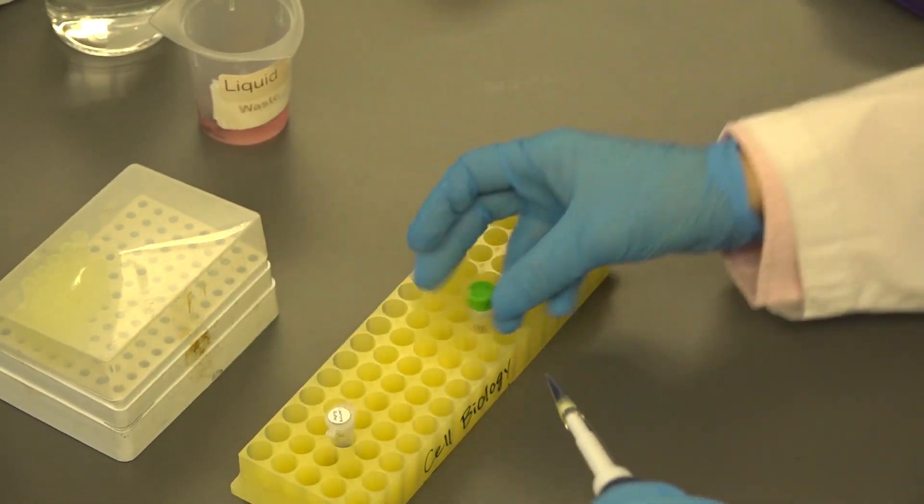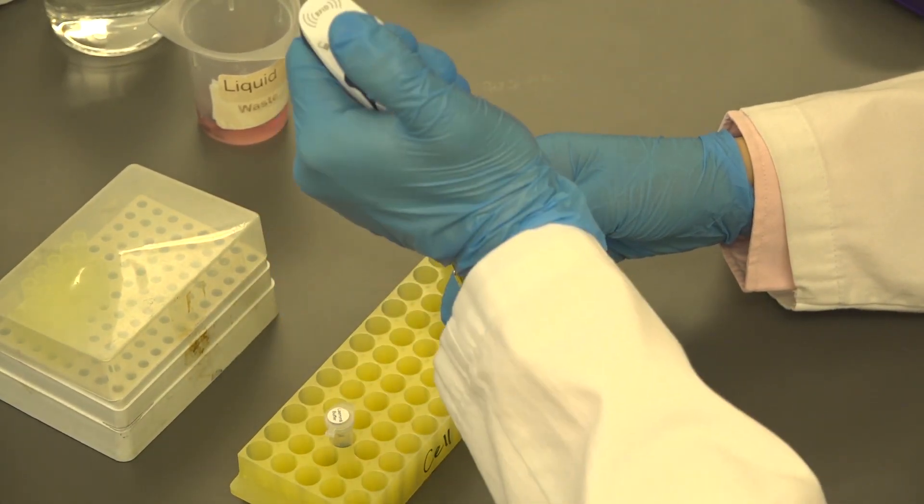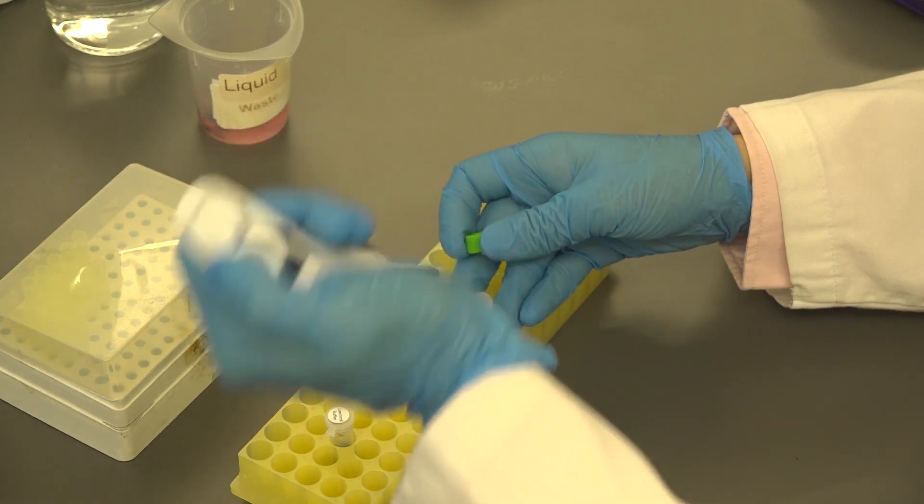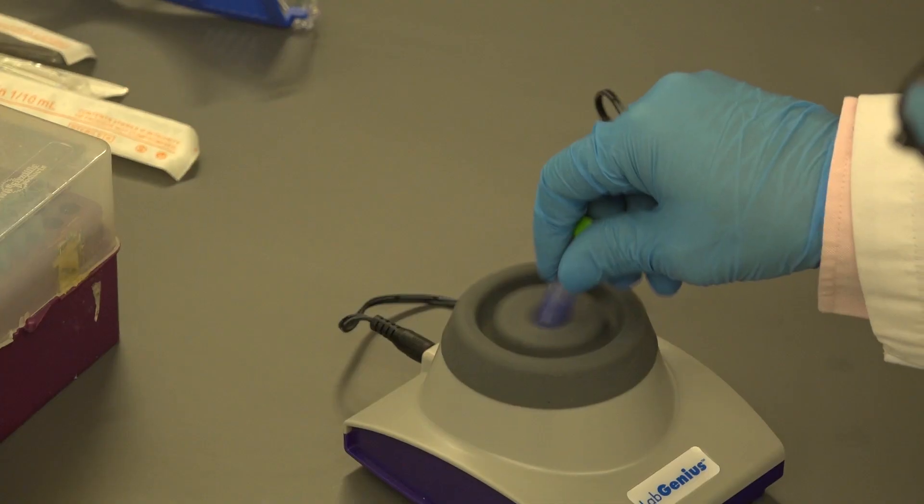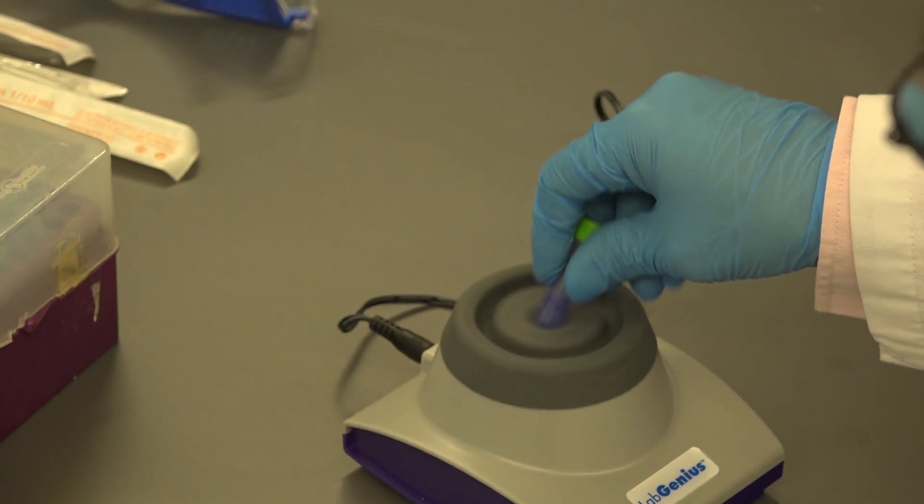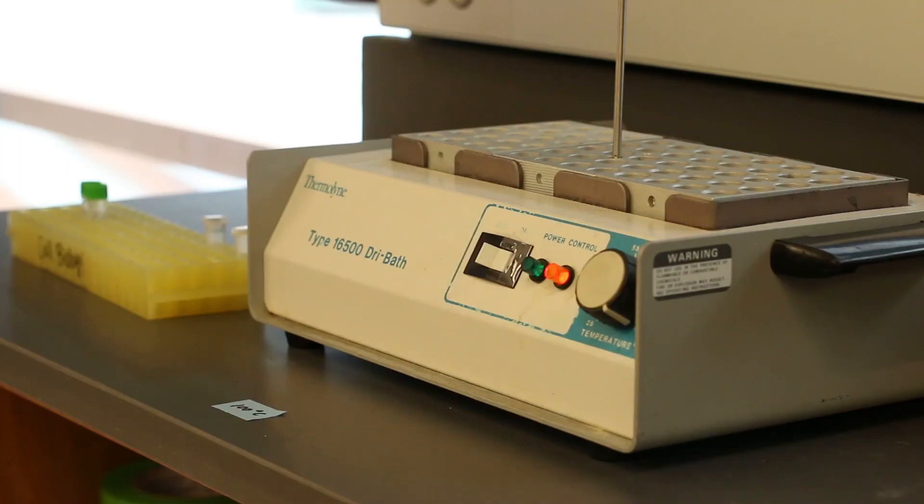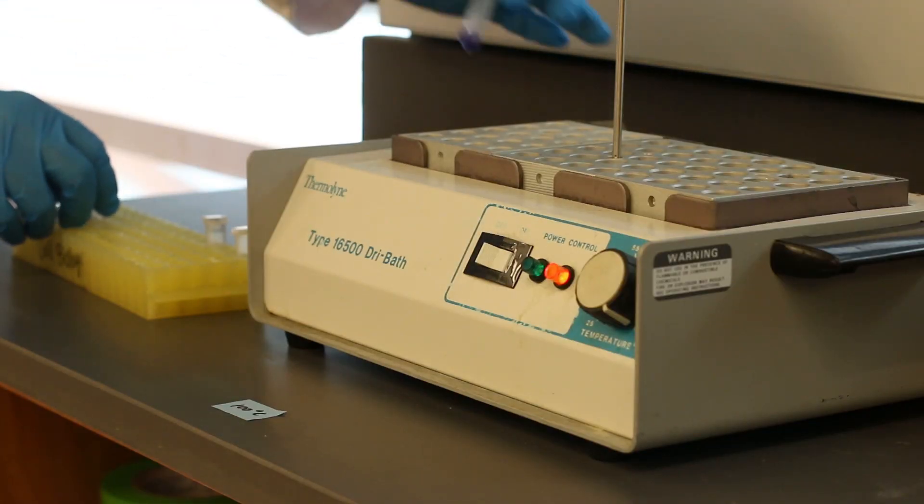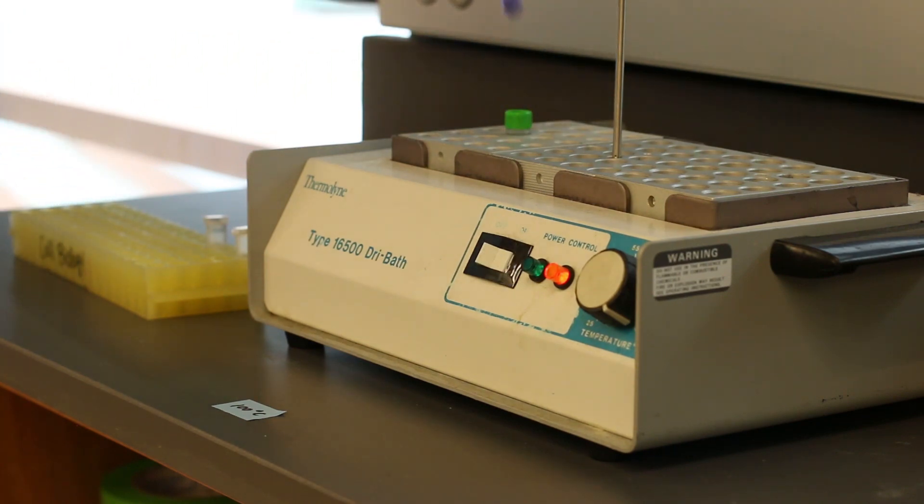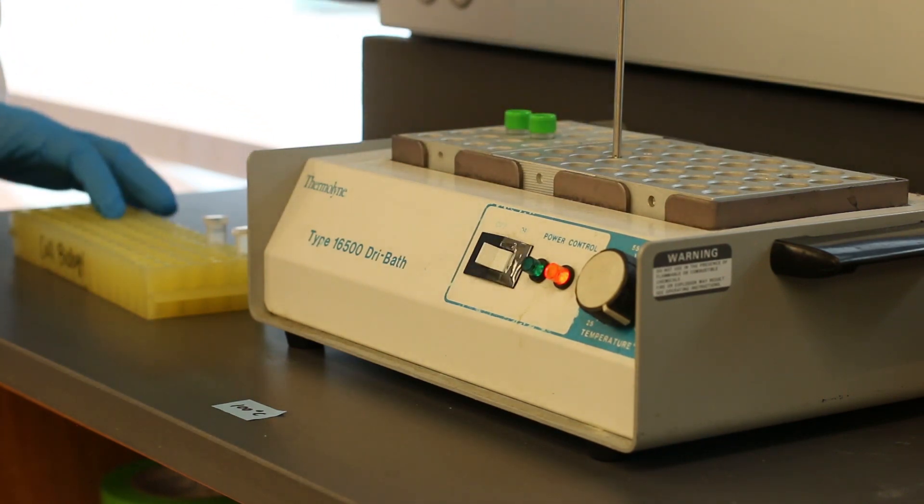Use a P200 to pipette 200 microliters of Laemmli buffer carefully into each tube. Vortex the tube until there's no visible clumps left in the tube.